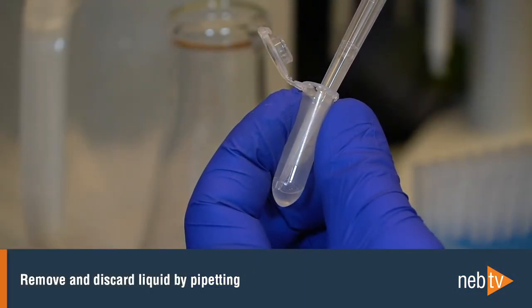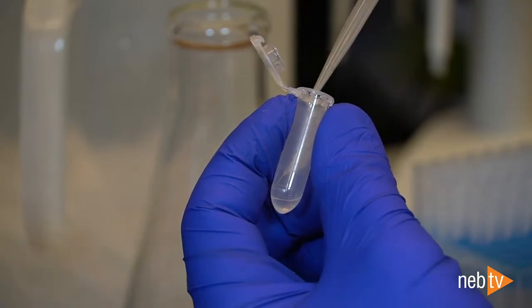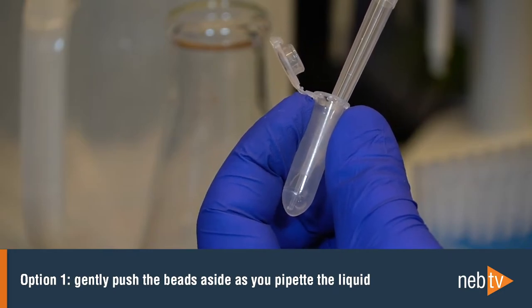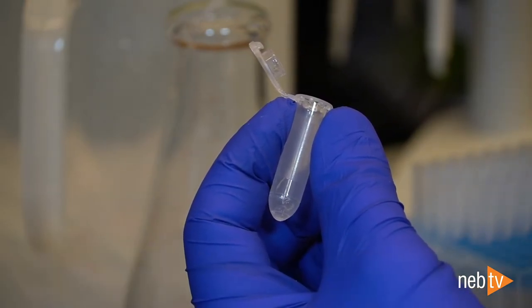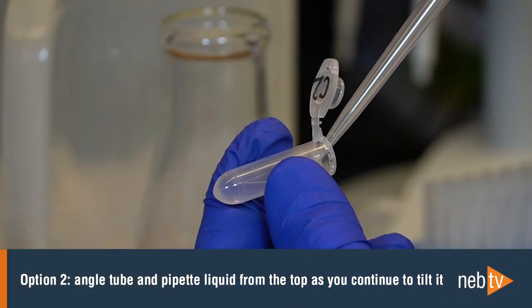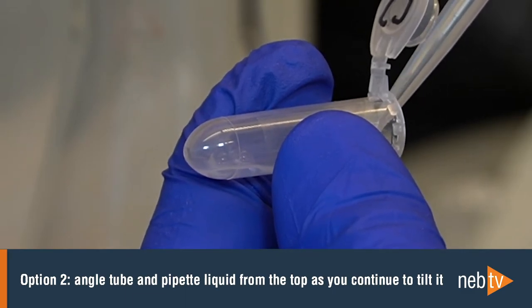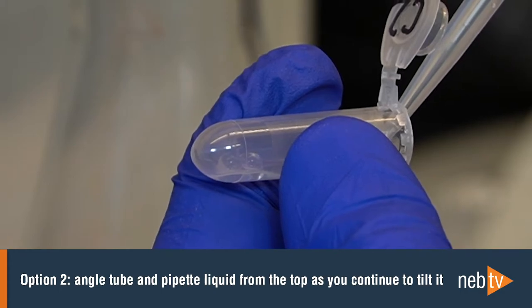After the inversions are complete, remove and discard the liquid by pipetting. There are two ways to do this. The first option is to keep the tube upright and insert the pipette tip, gently pushing the beads aside to remove the liquid. The second way is to angle the tube so that the beads remain at the bottom and the liquid reaches toward the tube opening, then pipette the liquid from the surface and continue to tilt the tube as you remove the liquid.